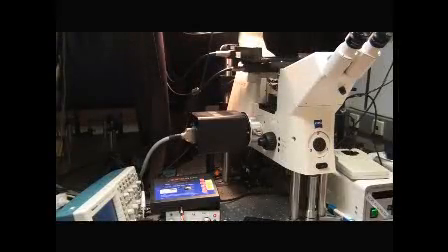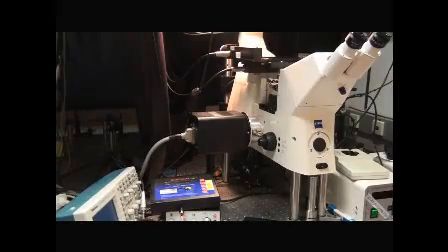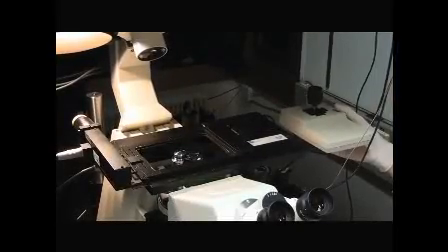After appropriate filtering using standard filter sets, fluorescence is imaged onto a back-illuminated CCD camera. Readout is performed in time delay and integration mode, which allows for scanning of large sample areas. For this, samples are shifted using a motorized XY stage synchronized to the line shift of the camera.